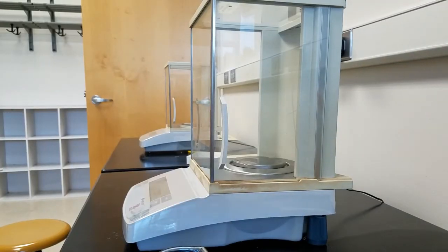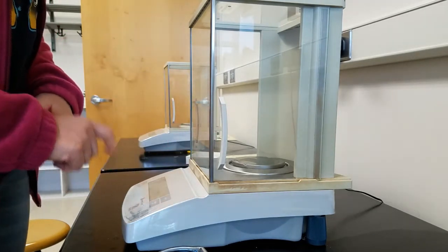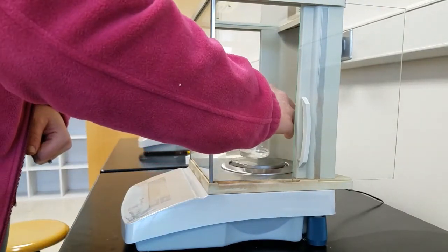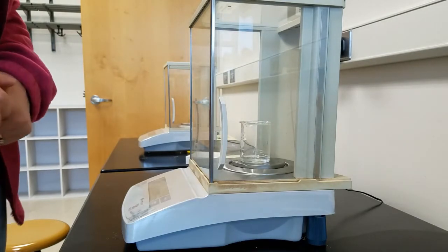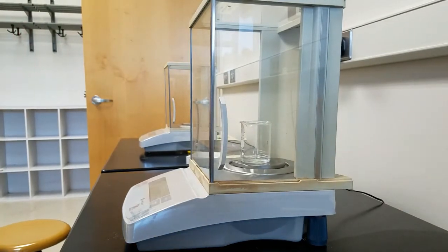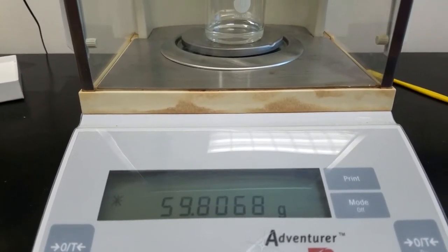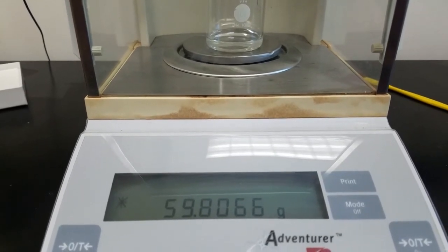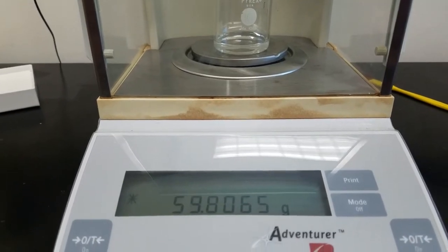To be as accurate as possible, you want to use the same balance that you used in your initial reading. Make sure that it says 0 on the balance. Place our water on in order to get the mass. The mass of our pipetted 10 milliliter water. Please record this value, and using this you can find the mass of just water without the beaker.